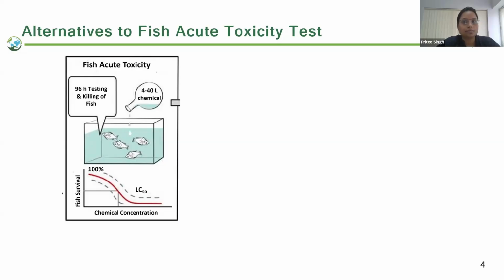Apart from this all, is there any question? Apart from all these things, a large number of tanks are also utilized, of different sizes. The end point is to determine the LC50 value or 100% mortality. If data is available, then NOEC or LOEC. In the revised guideline, there is no requirement for NOEC and LOEC.